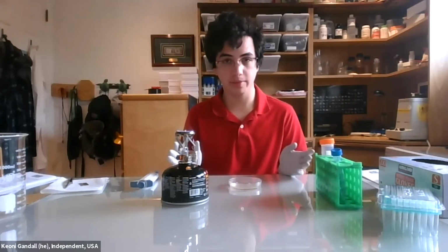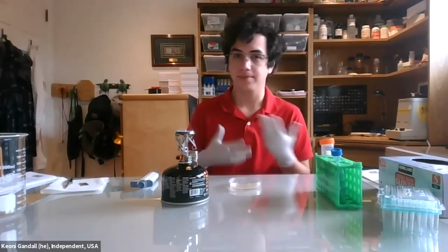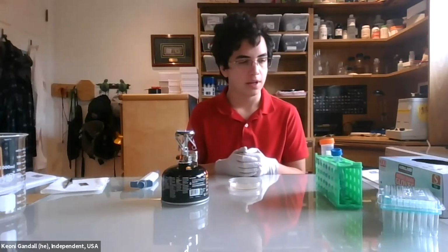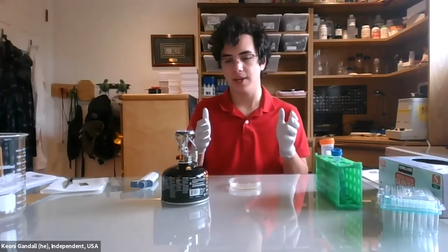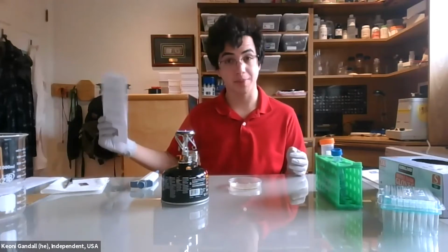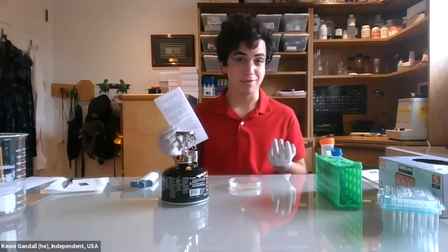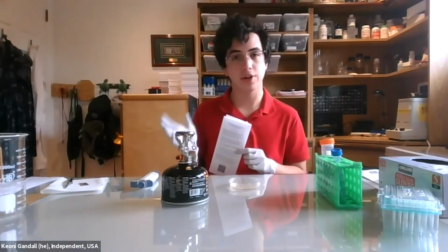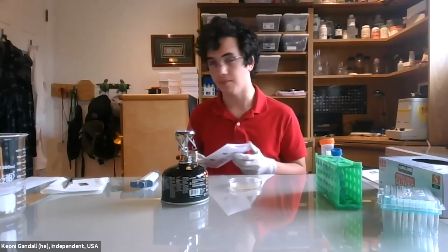The spores are extremely resilient to environmental damage or just humidity, DNAs. And so it's a really efficient way to store lots of DNA in a small amount of space, cheaply, at room temperature. And if you want, you can share it with friends. There's no need to worry about conditions, dry ice, all that stuff.